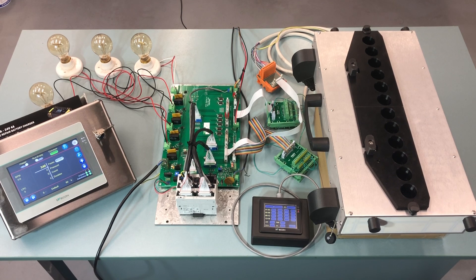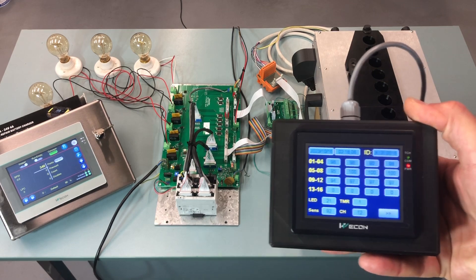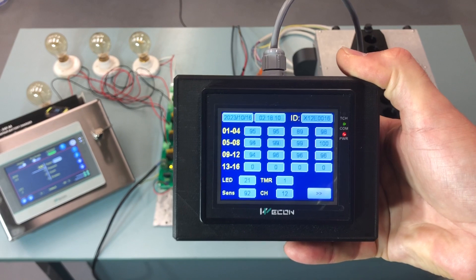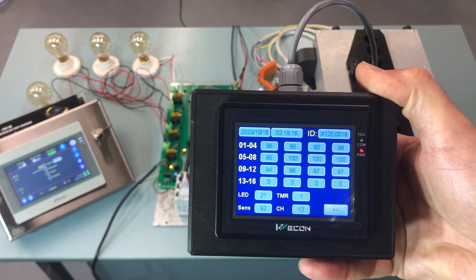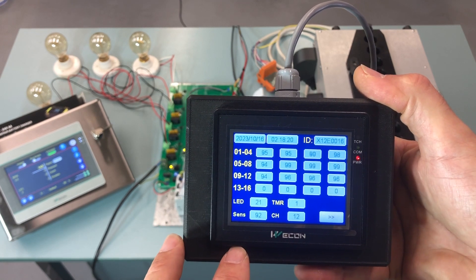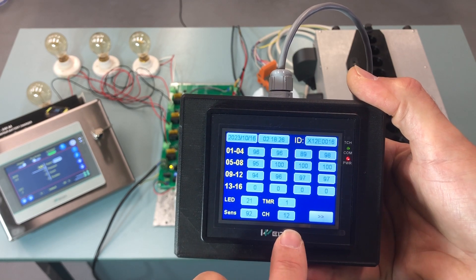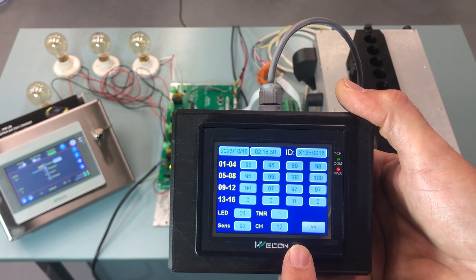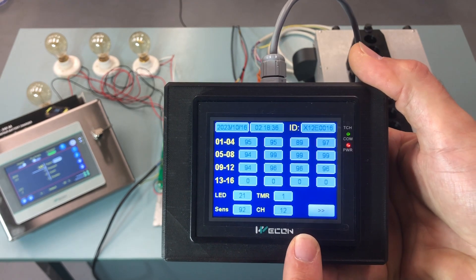The first thing we check is the QA terminal to see how the counting head is performing. You can see here that all the channels are above 80%. The LED drive is at 21%, sensitivity is set to 92%, there are 12 channels, and the timer is 1 millisecond. I've said that before, so that would not have changed.